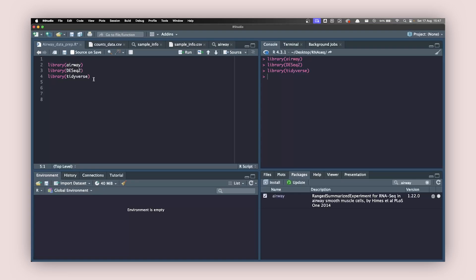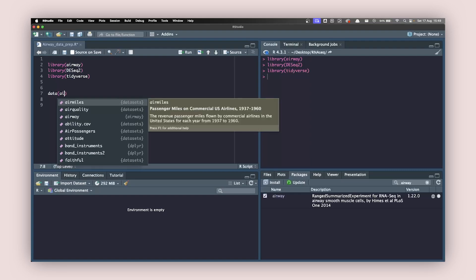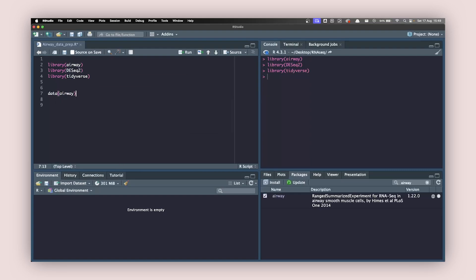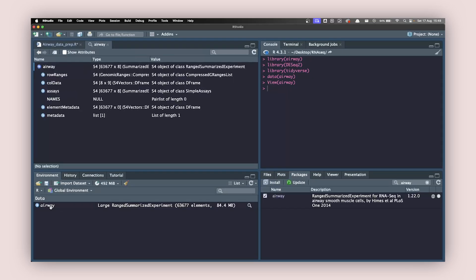First things first, we are going to prepare the data that we want. We write data(airway) to load the airway data. You can click on it to see what is inside the airway dataset. The two things we are interested in are the colData and the assay.